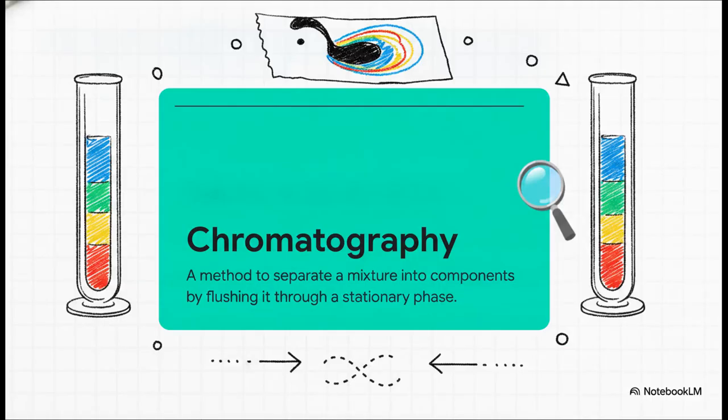To get that exact quantity, we need a seriously reliable tool. Today, our playing field is chromatography. By definition, this is a method where a complex mixture is separated into its individual components by flushing it through a stationary phase. Imagine taking a single drop of black ink, putting it on a paper towel, and letting water wick it up. The different colored dyes that make up that black ink are going to travel at different speeds and separate into neat little bands. That fundamental mechanism is exactly what allows us to isolate our target before we measure it.